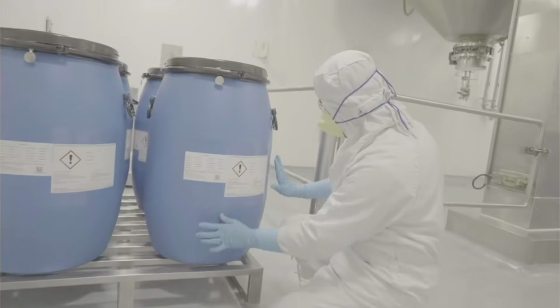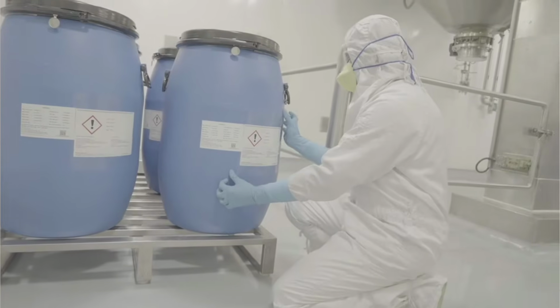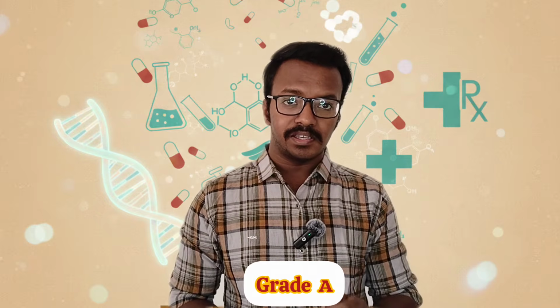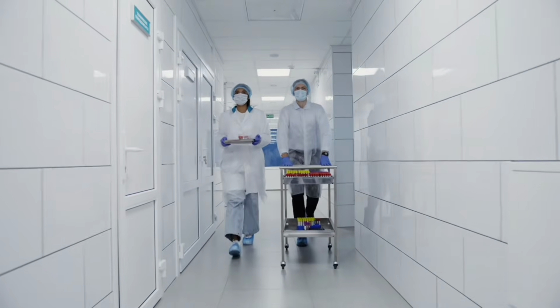The same manufacturing area is also classified into raw material storage room, dispensing room and filling station. Here the manufacturing area is considered grade C, but the filling area is a high risk zone, so that comes under grade A. So our environmental monitoring people monitor all these areas during the batch.